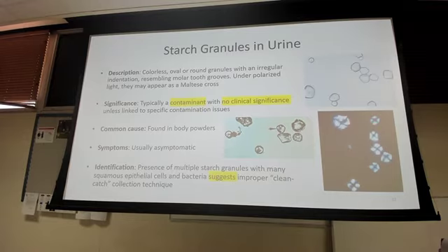Okay, so starches, not really clinically significant, it's just contamination. So that's just powders that come off of the stuff that you put on your skin and can come off your clothes.